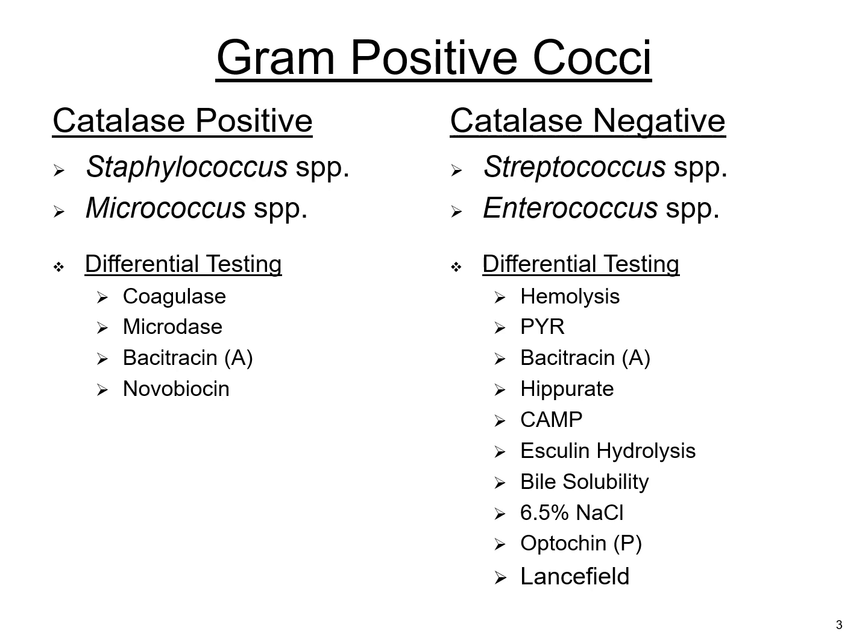So based on appearance and catalase positive, we would look at our Staphylococcus or Micrococcus. And then from there we would differentiate those out depending on which genus. And for catalase negative, Streptococcus and Enterococcus. And depending on how it appears on the plate will depend on what particular test we do next.